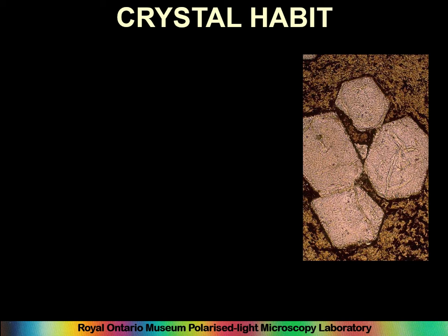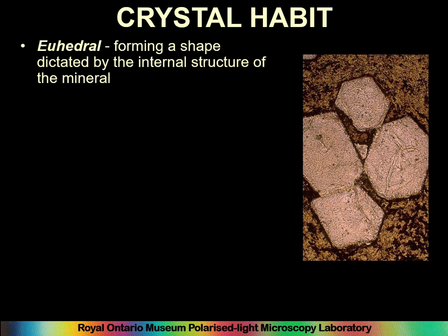But if you have described it, then other people can say, oh, I think they found this, even if you can't identify it. So it's far better to describe it than to identify it. Although it's actually better to identify it correctly, of course.